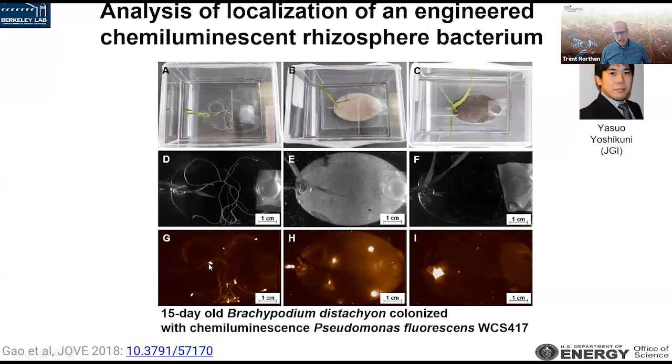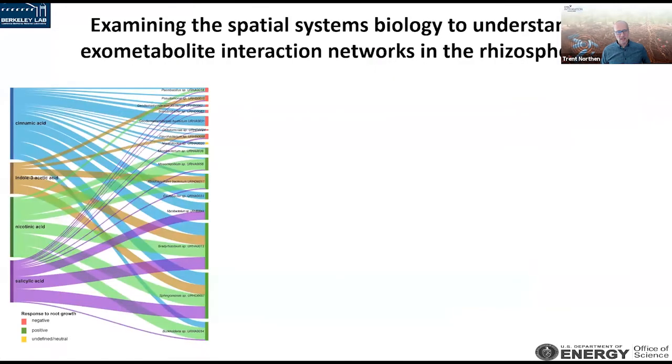And then imaging them, we can see that the microbes really like to grow at the root tips in the hydroponic, also in the sand. In the soil, you still see them at the root tips, but they're also growing a little bit more at the plant base, possibly due to oxygen limitations in the soil, which again connects back to Zoe's talk this morning.